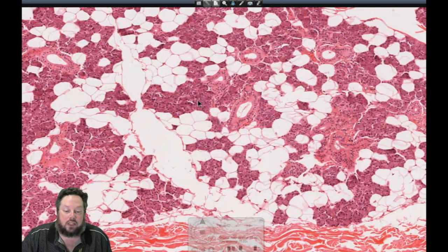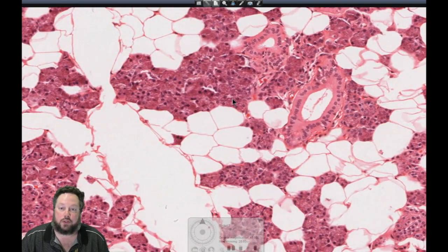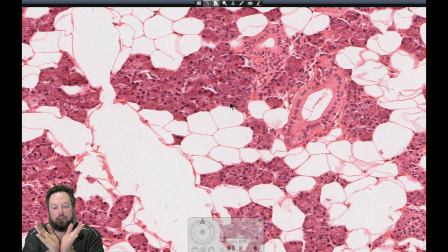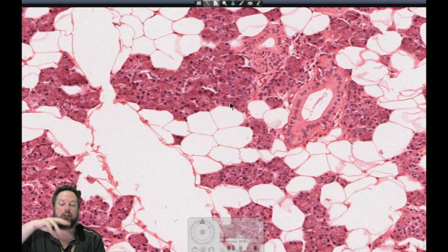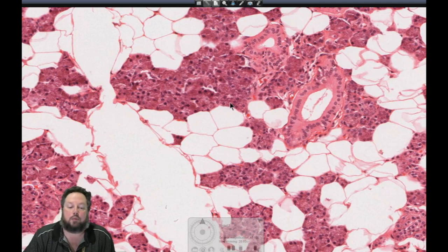Entirely serous means that the cells are protein producing, and so they're producing an enzyme, as I say, salivary amylase. They have a protein-producing appearance, so the cells are kind of pyramid shaped. They have a flat base with a big round nucleus at the bottom, and then they peak at the top and secrete into a duct at their apical surface, and that first duct is known as the intercalated duct.